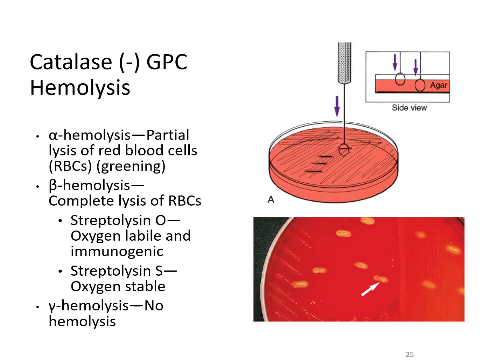So when you stab that agar plate, it gives it an anaerobic type environment to grow in, and it enhances that hemolysis pattern. And so again, just to go over the different types of hemolysis, you have alpha hemolysis, which is a partial lysis, and you have a greening type hemolysis. Beta hemolysis is complete hemolysis, and you get a complete clearing or a yellowing type color. And you have gamma hemolysis, which is no hemolysis.